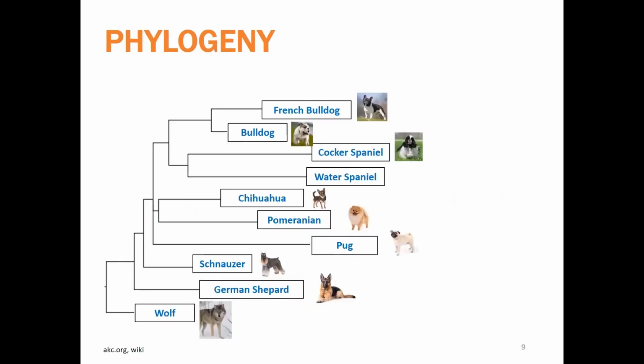This is just an example of a phylogeny that I made. Phylogenetic trees are used to describe the relationships among groups of organisms, and can be constructed based on the genetic sequences of the organisms. A rooted phylogenetic tree presents a model of evolutionary history that's depicted by ancestor-descendant relationships between the tree nodes, clustering sister or cousin organisms at different levels of relatedness, as shown in the figure here.